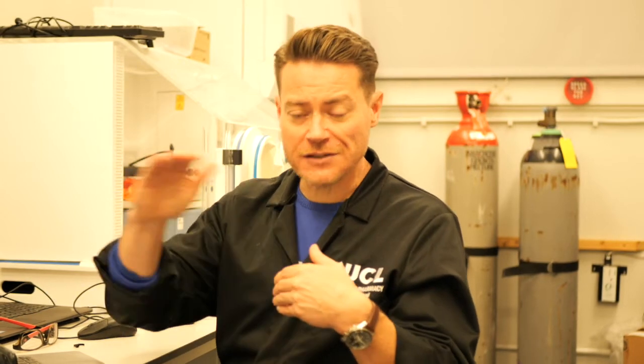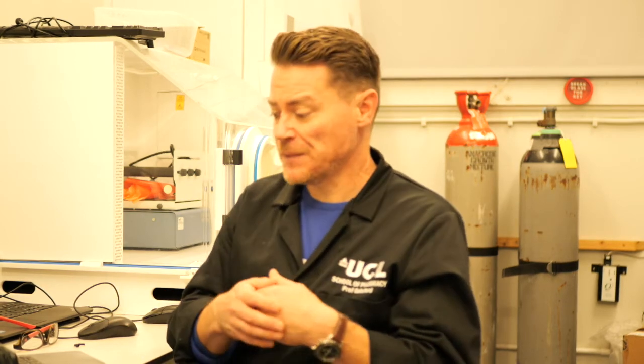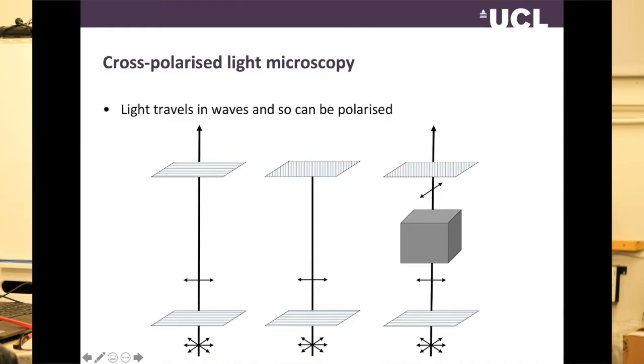In a hot stage microscope, you can do the same thing. So if you heated the sample up at 10 degrees per minute in the DSC, you can heat it up at 10 degrees per minute in the hot stage microscope. And rather than measure some sort of phase change, you're just looking at the sample. So for instance, if you say that in the DSC, this particular endotherm corresponds to melting, then when you look at your sample in a hot stage microscope, you should see it melt at that temperature. If it doesn't melt at that temperature, you know you've misinterpreted your DSC, for instance. Okay? So it's a very useful technique for running alongside the DSC. You can match the heating rate, but you're actually looking at the sample to see what it is doing. So that's quite a good technique.